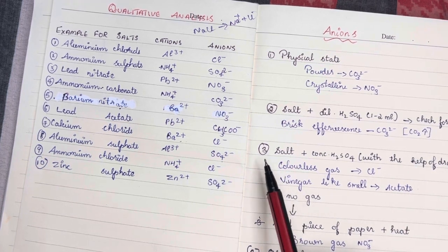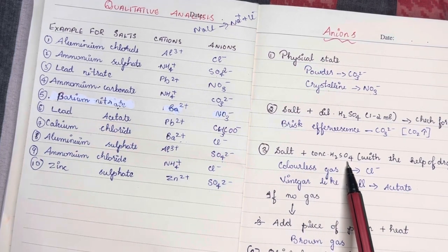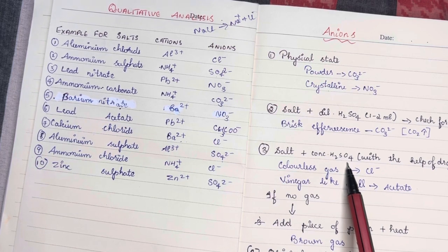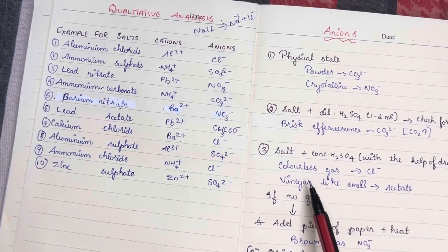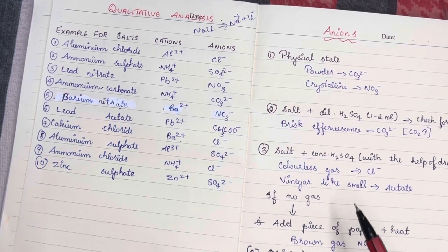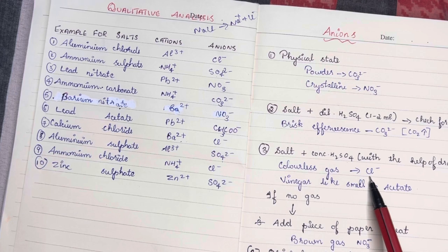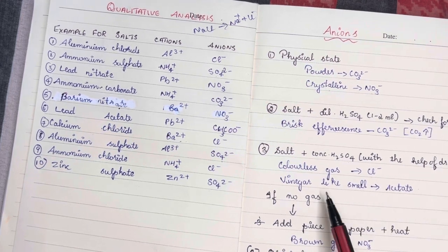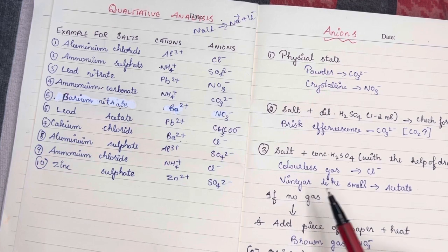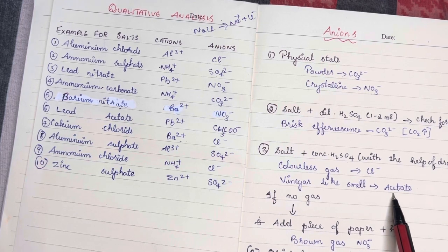Again, treat the given salt with concentrated sulfuric acid. When you add the concentrated sulfuric acid, be careful and add it with the help of a dropper. If the gas given out is a colorless gas, then the salt contains the anion chloride, that is Cl minus. And if it has a vinegar-like smell, after adding the concentrated sulfuric acid to the salt, you just smell the gas. If it is a vinegar-like smell, it means acetate will be present.